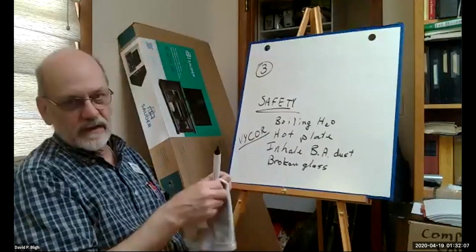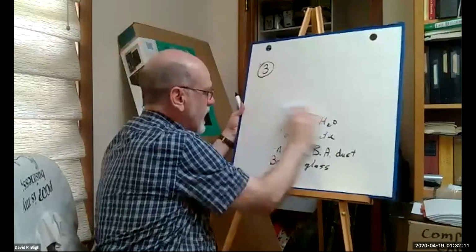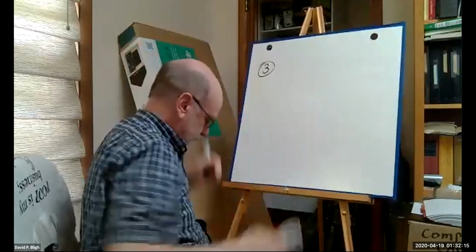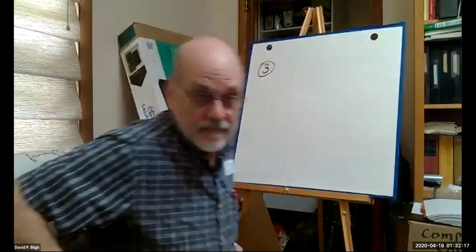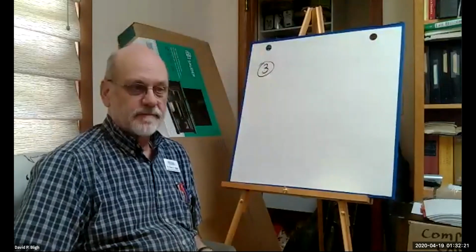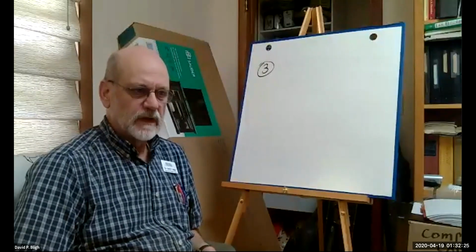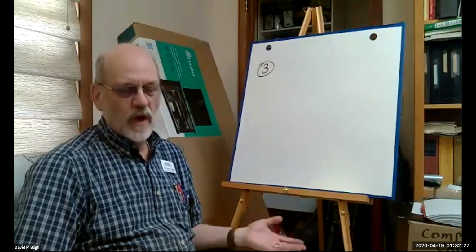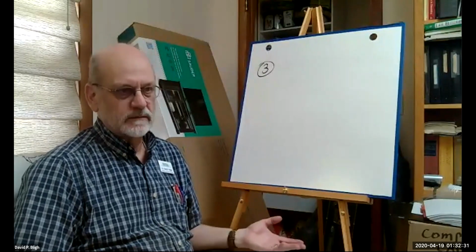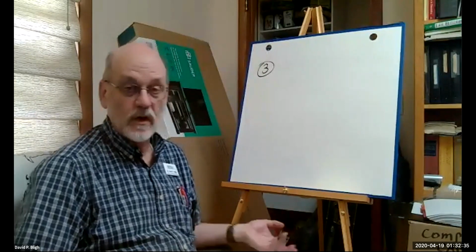Now let's talk about experimental error. Where could you experience error? Right? Where could you have error? Well, let's see. Let's look at our instruments first. Water's going to boil. That's no big deal, right? It gets hot. We just want it hot. We don't care what temperature it is, as long as it's really hot.